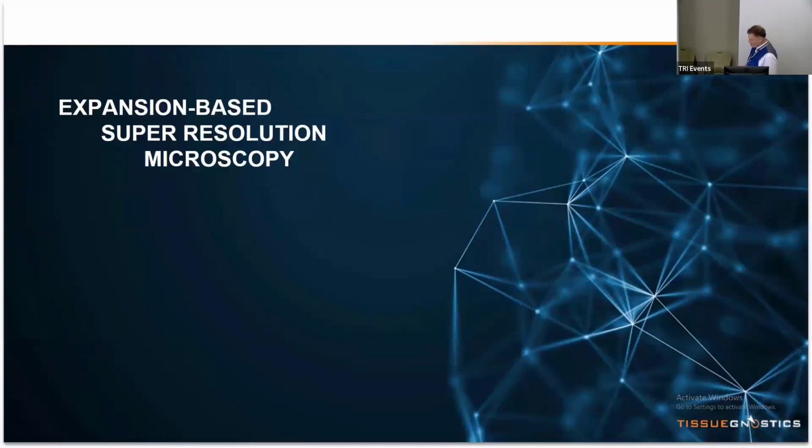I would also like to refer to a technology which I find very exciting when we consider increasing the resolution. The spectral unmixing is a way to increase the spectral resolution, to separate spectrally overlapping fluorochromes. But also when you want to increase the lateral resolution in your system to see events which are very close to each other, you can, of course, increase the magnification.